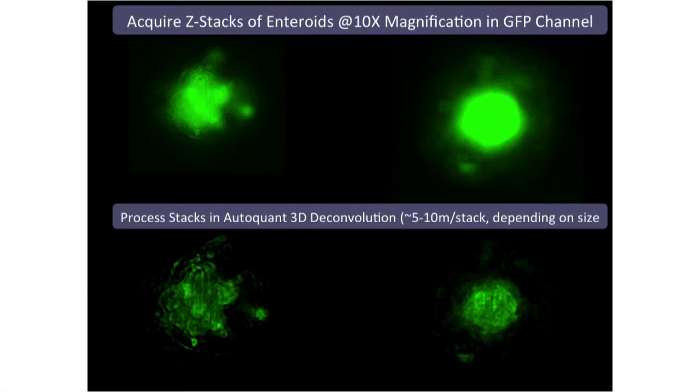We selected our regions of interest and wanted to investigate them further. The previous data was at a lower magnification — 4x and 10x. In this case, we're going to acquire a Z-stack, which means acquiring images at varying height levels, because we may not be able to get the whole structure in focus with a single image.